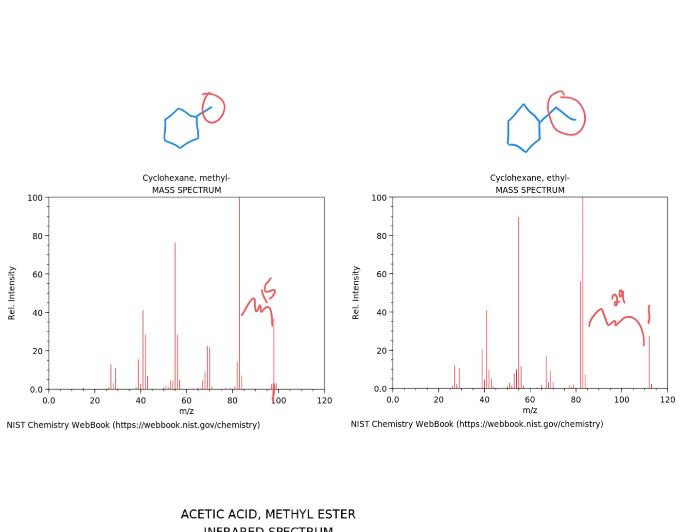Other types of splits that you see with mass spectra, we could get into way more detail than this, but I'm not really looking for that most of the time. You will see that this is about 15 in between most of these, and we see the same pattern over here. That's because you're losing one carbon at a time. That's sort of what we see, but I'm not that concerned past that level about mass spectrometry.